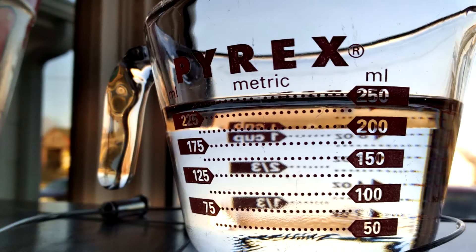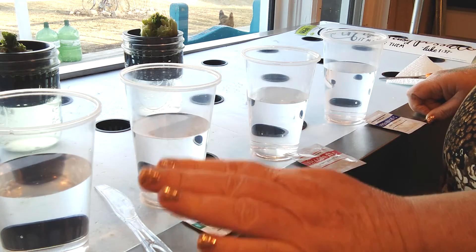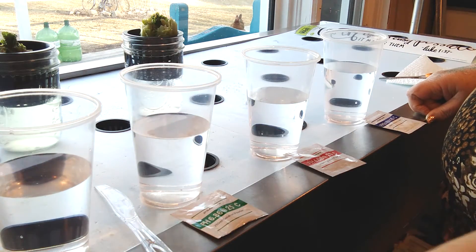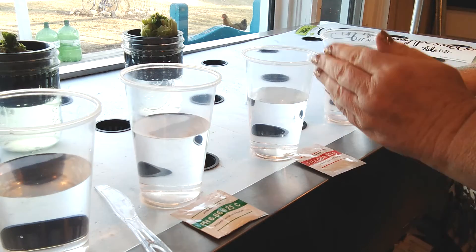You want to have 250 milliliters of distilled water for each solution, as well as a container of distilled water with no solution so you can rinse off your calibration unit in between dipping it into your solutions.